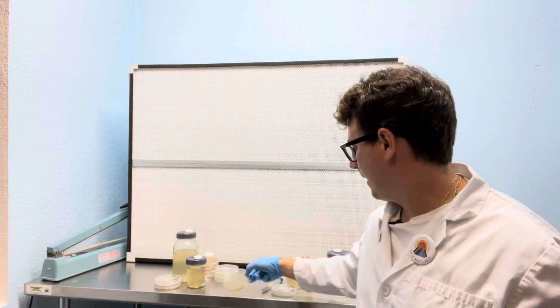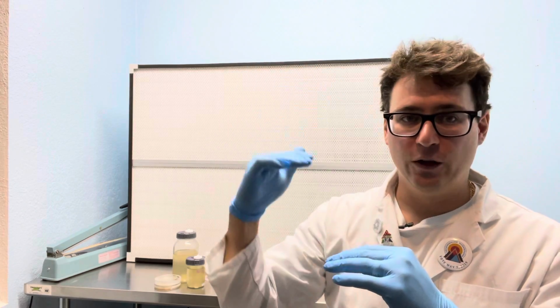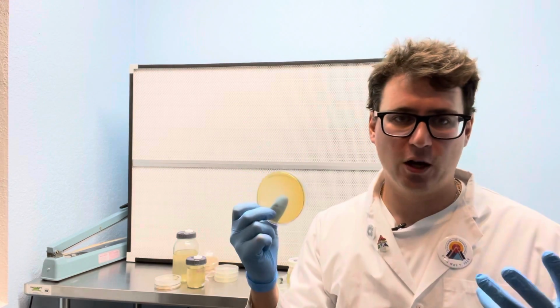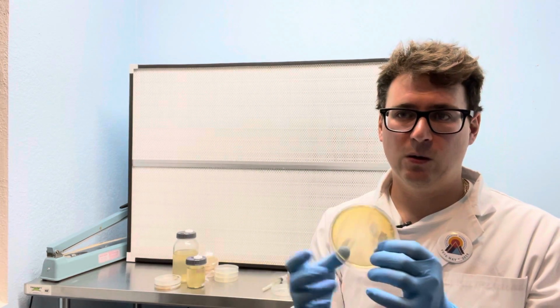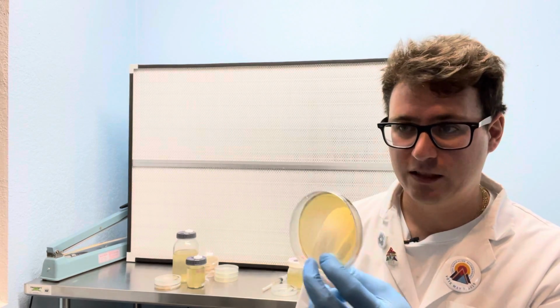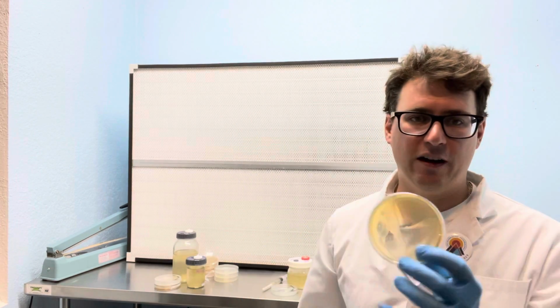The benefit of using agar is that it creates a two-dimensional filter for the mycelium. For a technician like myself or a mushroom cultivator, it's really important to be able to identify contamination, because you don't want to replicate an organism that you're not trying to cultivate, because it's going to compete with the mushrooms.